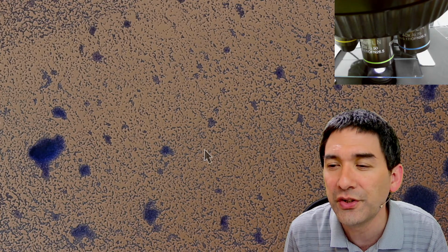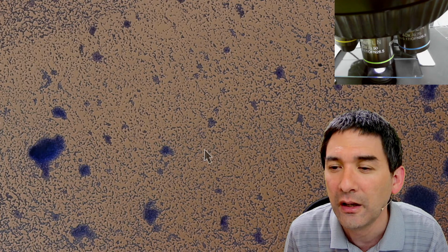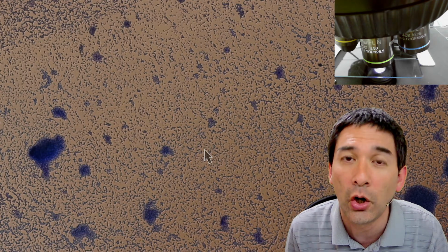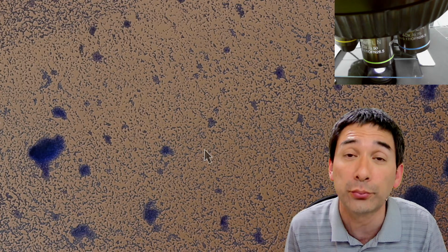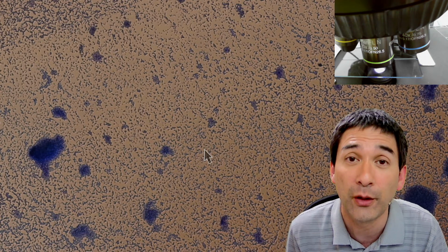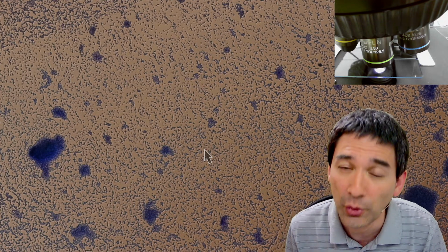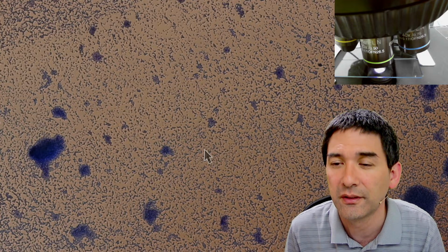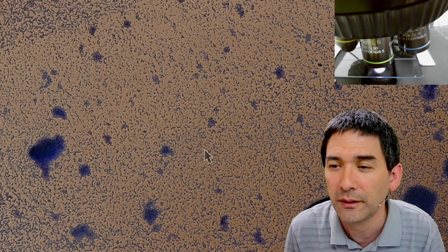Back on topic, once you have the cultures completed, how do you dispose of them? Well, I have to autoclave them, so I'll put them into a pressure cooker for half an hour, and then I can dispose of them in the regular waste, because everything's killed off.